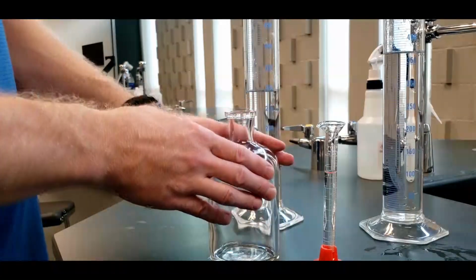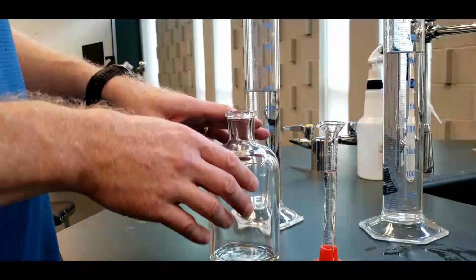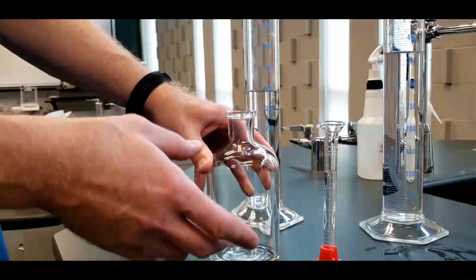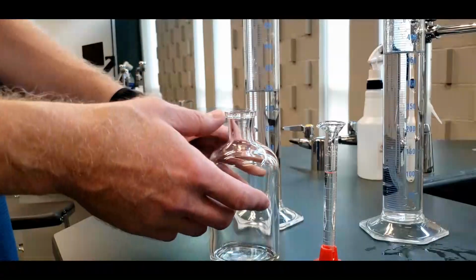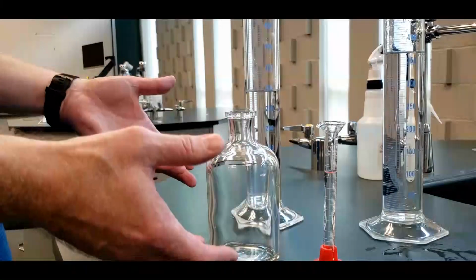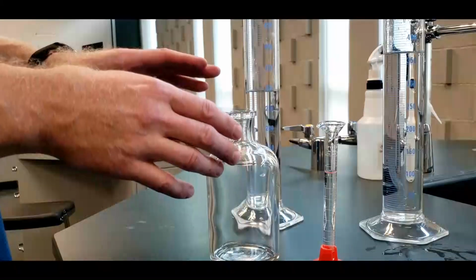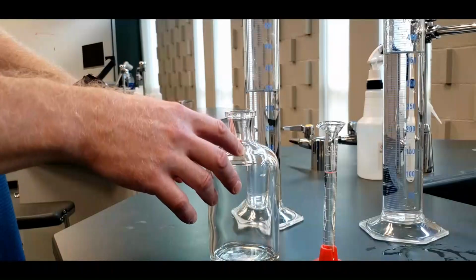Once we make our solution, it's going to be approximately 0.1 molar. The reason we don't try to be exact about it is that sodium hydroxide is hygroscopic. In its solid form, it absorbs water from the air. So as you're trying to make up the solution with the sodium hydroxide pellets, they are changing mass on the balance, so you're really not sure what you got in there. We know that it's going to be close to 0.1, but we're going to find out exactly using a titration with KHP. We'll talk about that next.